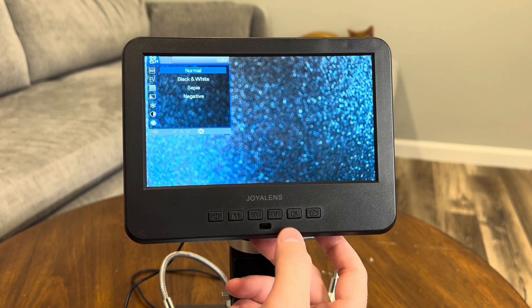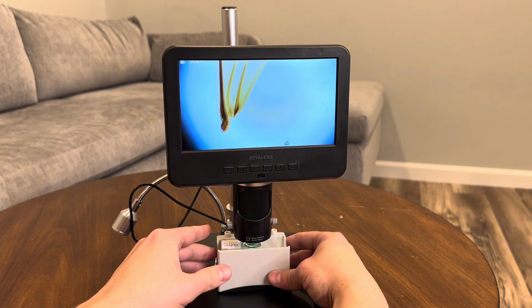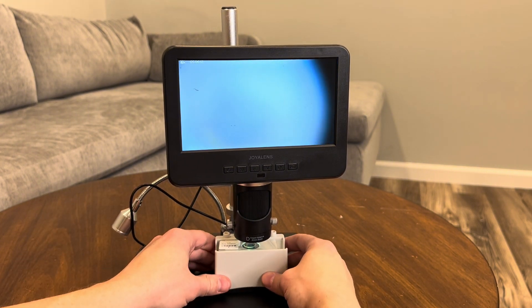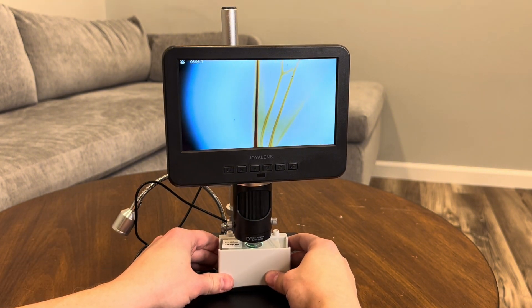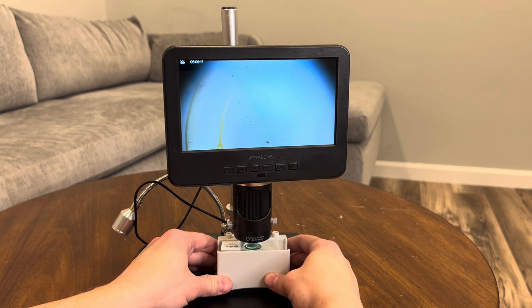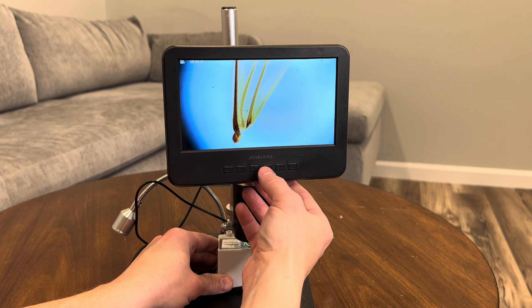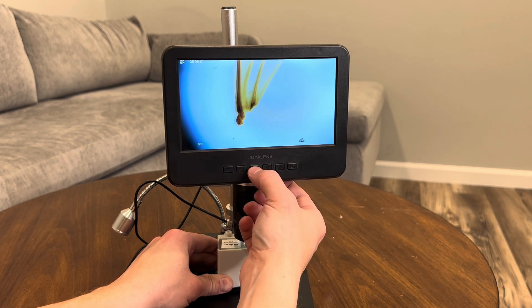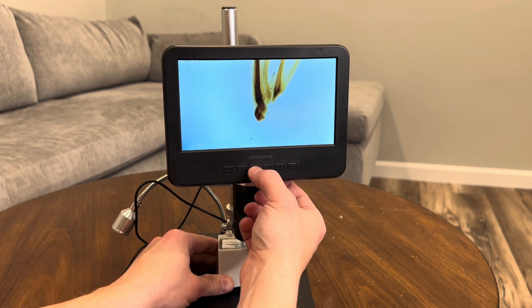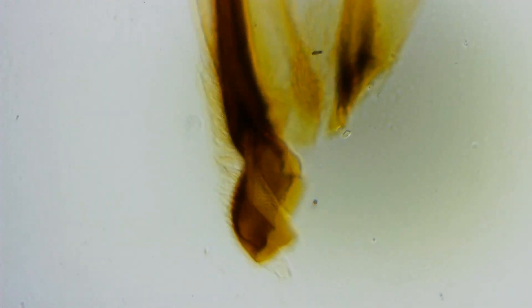Now that we've gone over the setup and key features, let's dive into performance. We'll start with a biological slide — I'm using a sample of a honeybee's wing, which is great for testing the microscope's ability to capture intricate details. The overall structure is clear, and the 7-inch display really helps show off those details. The image is crisp, and there's no noticeable distortion. The zoom control is smooth, and the microscope maintains focus even as we increase the magnification. Here I am using the zoom function on an actual recording taken on the microscope.